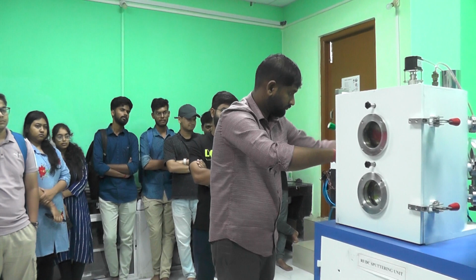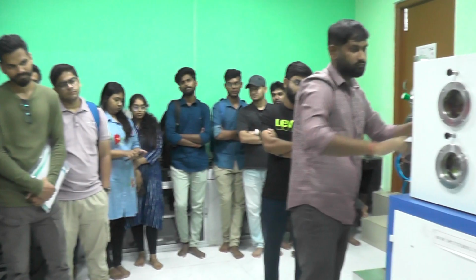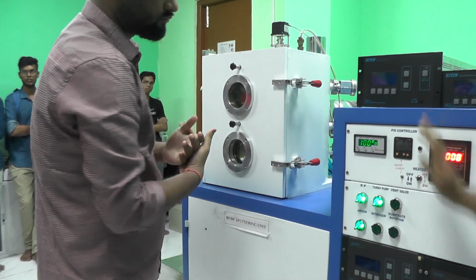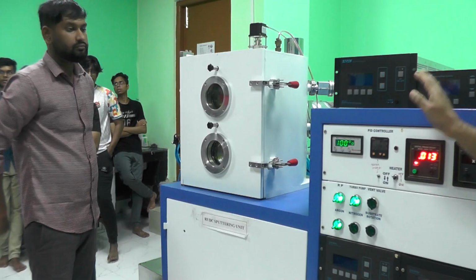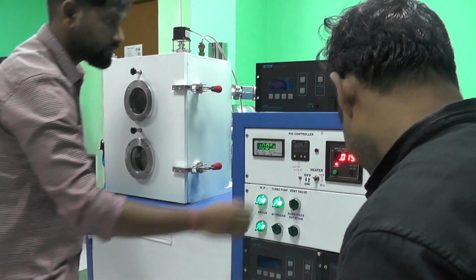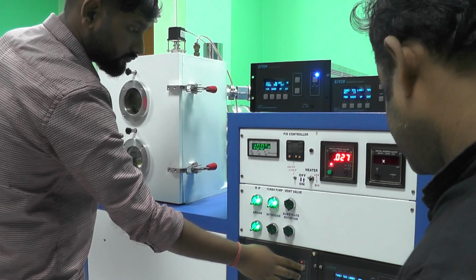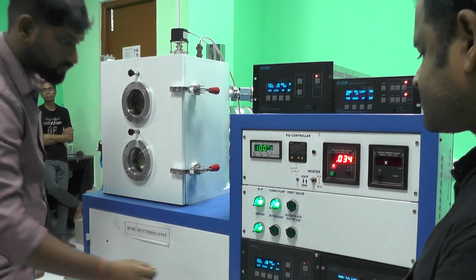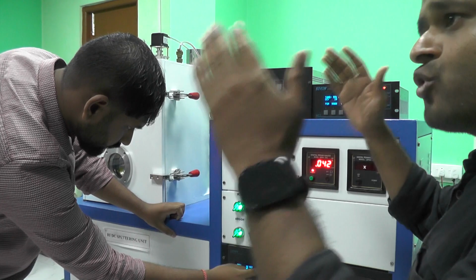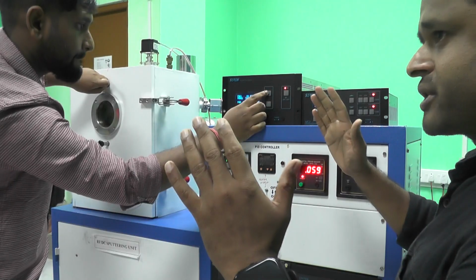We have two power sources, this RF1 and RF2. We have one DC source as well. DC is used for conductive material, whereas non-conductive materials are coated by RF. So shall we start? We have loaded two magnetrons here.